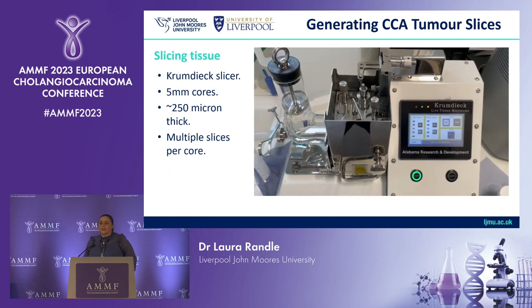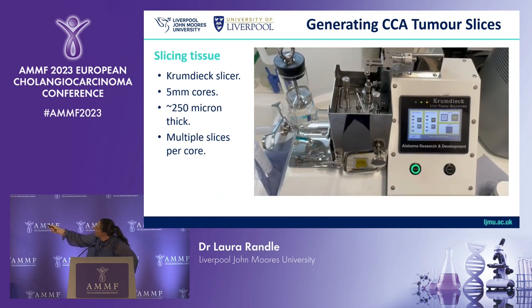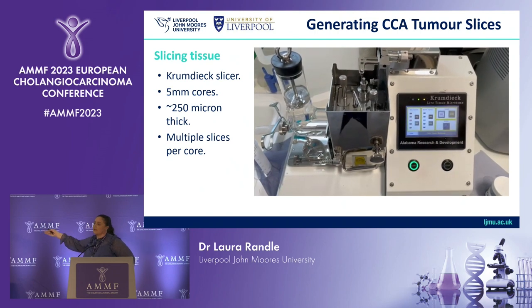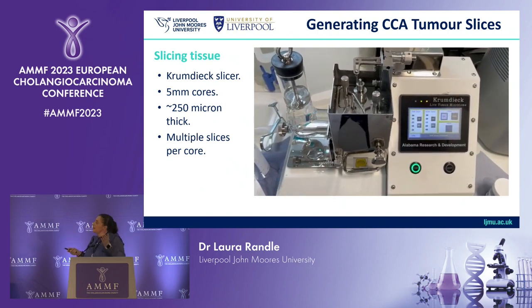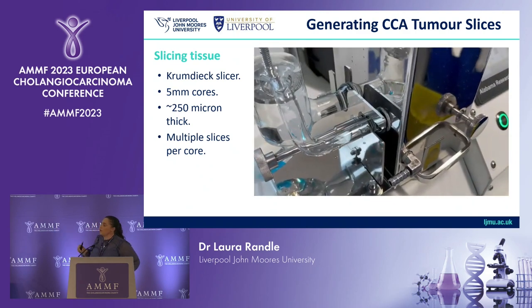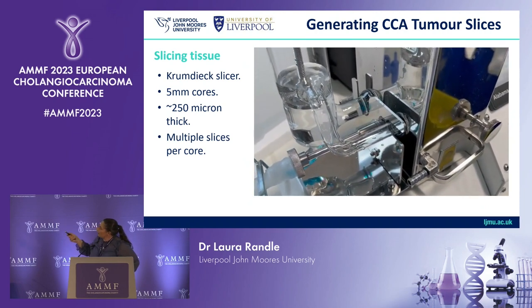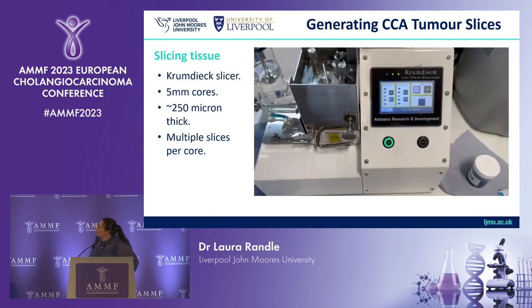So some of you will have seen this before. This is our tissue slicer, and here we have our specimens in this holder, and this reciprocating arm moves the tissue backwards and forwards over a blade. This machine is currently set up with blue agarose plugs, which enable us to set the thickness, and we collect our slices as it cuts into the glass trap here, into Krebs-Henseleit buffer.